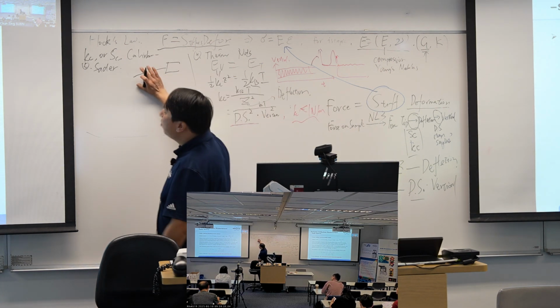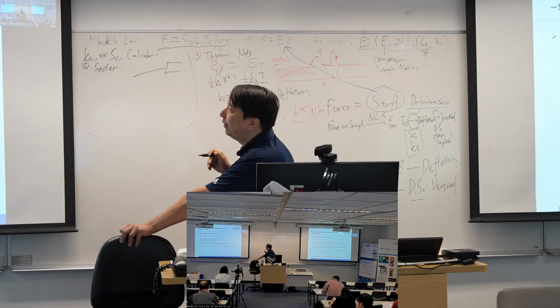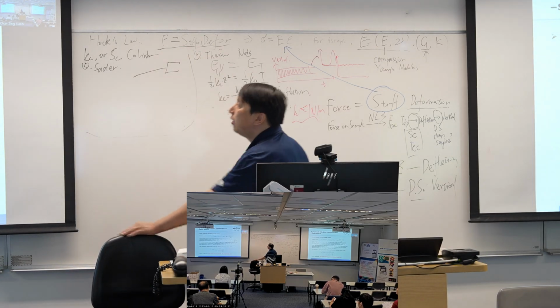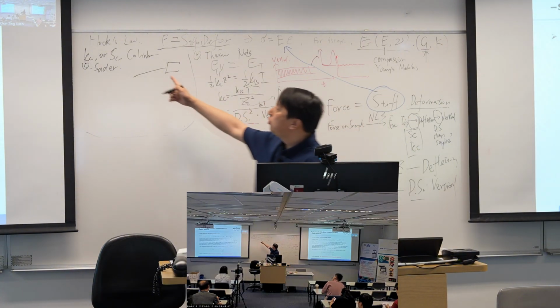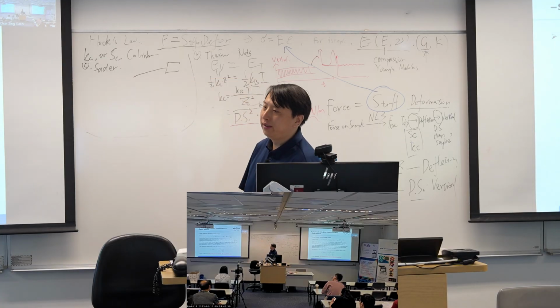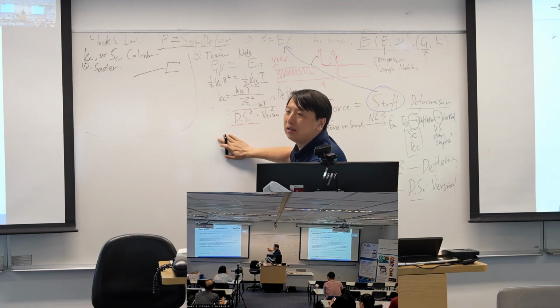So it will sense some friction or hydrodynamic force due to the environment outside. Basically, in this theory we can write down the Newton equation.